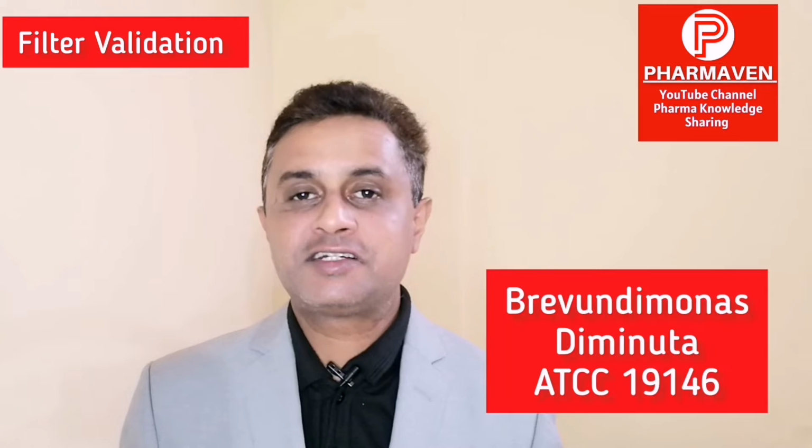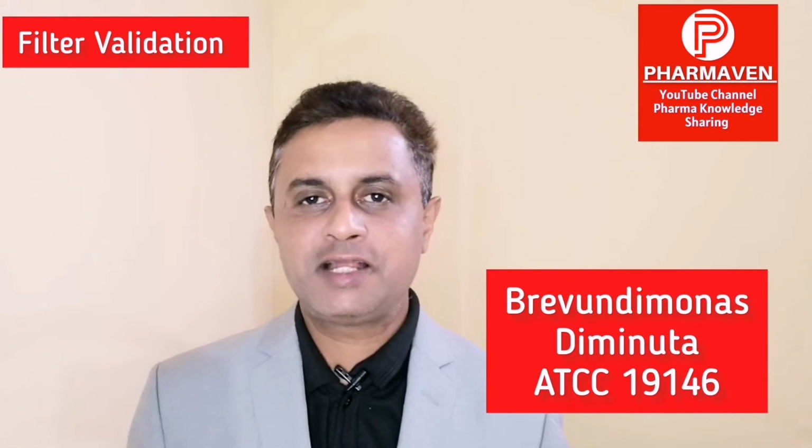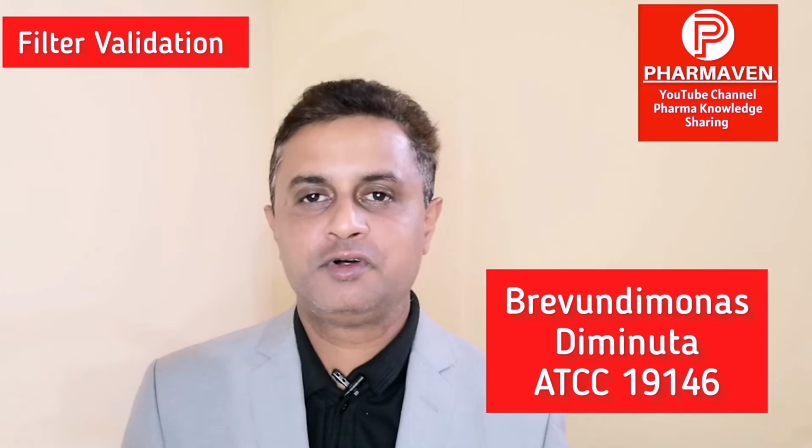So how can we start? We first have to prepare the culture media. The culture of Brevundimonas diminuta ATCC 19146 has to be inoculated in tryptic soy broth to achieve 10⁷ per ml concentration of the bacteria.